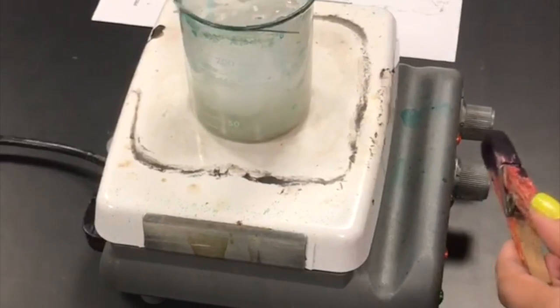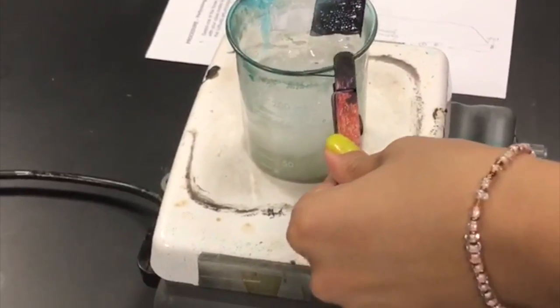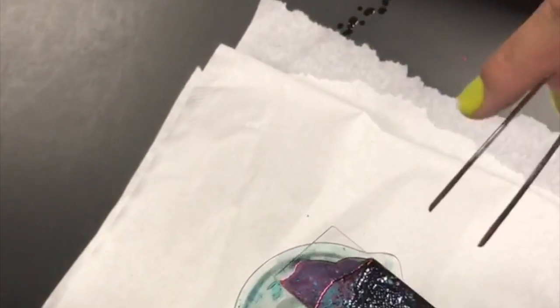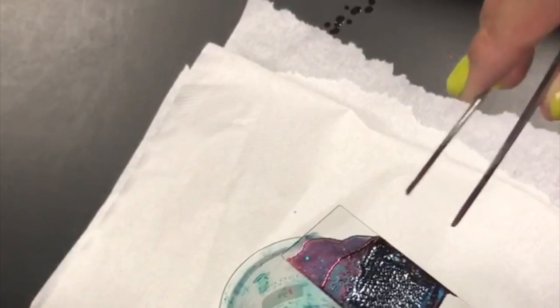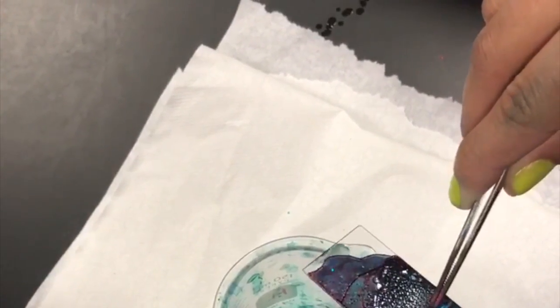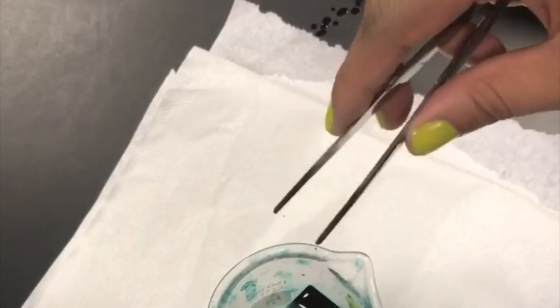After your slide has been steaming for about 5 minutes, you're going to use your clothespin to remove it from the steam. And you'll turn that off. Then you're going to use forceps to remove the paper towel that is on the smear. And you are going to discard it into a beaker, not into the sink.